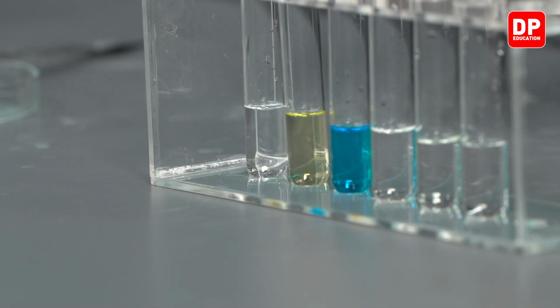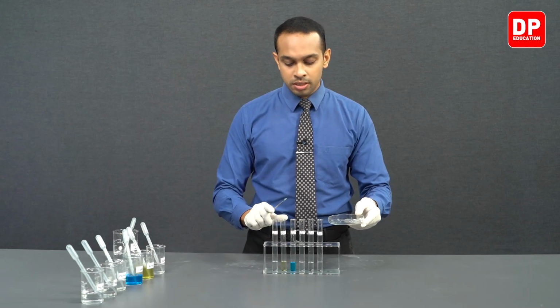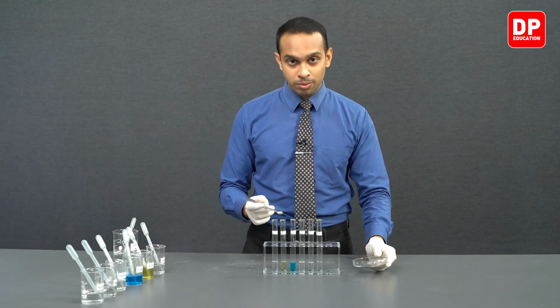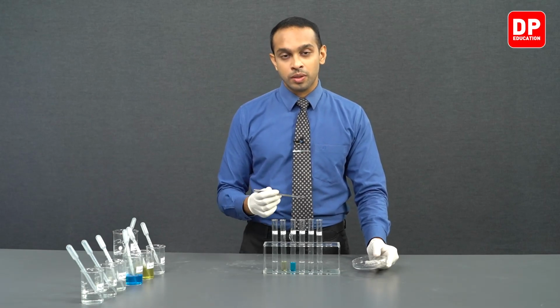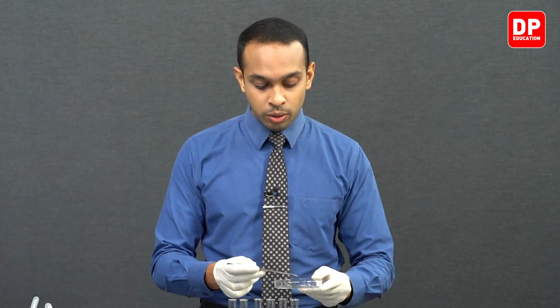Now students, we are going to be adding magnesium metal pieces into each of these solutions we have over here. Keep in mind, as soon as you add magnesium, you will see a reaction happening, as magnesium reacts slowly with water as well. So you will see a reaction taking place, but keep in mind that will not denote whether magnesium is displacing the metal ion in the medium or not. So we will get on to the details about it after adding the magnesium pieces into each of these test tubes.